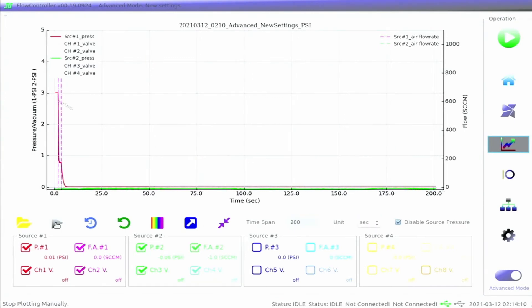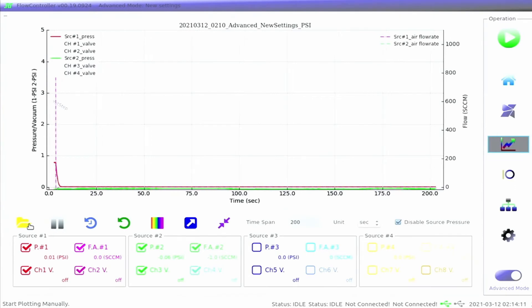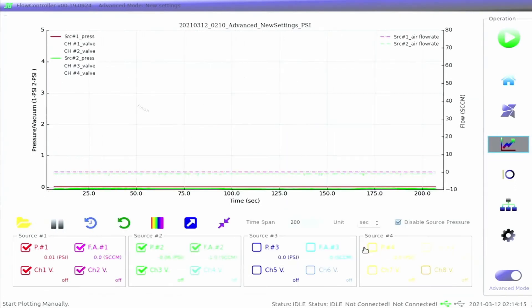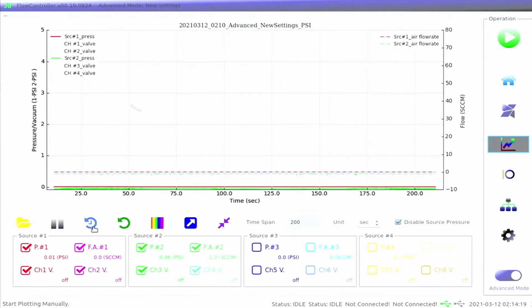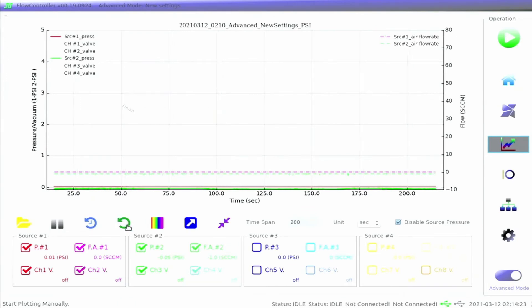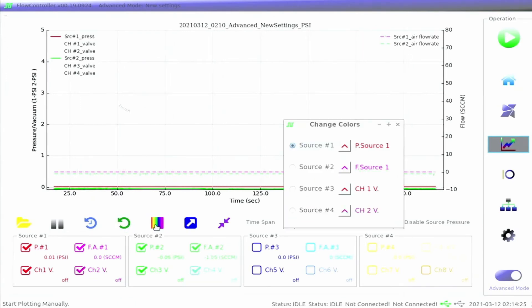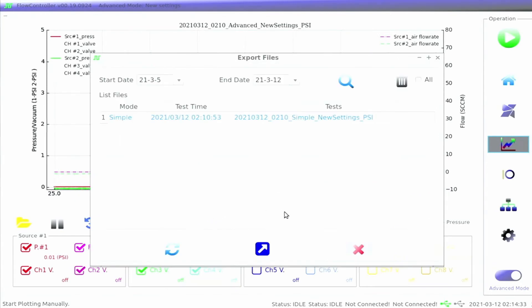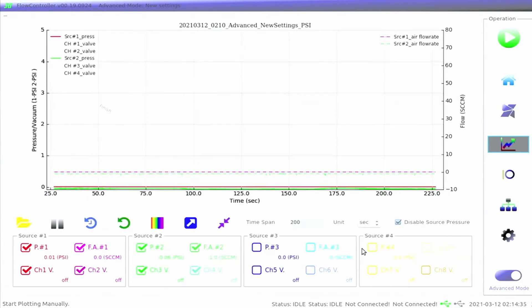Users also have the option to change the units, pause or resume the graph, import saved files, restore all data, reset and clear all data, set different line colors, export data files, and adjust the viewing window.